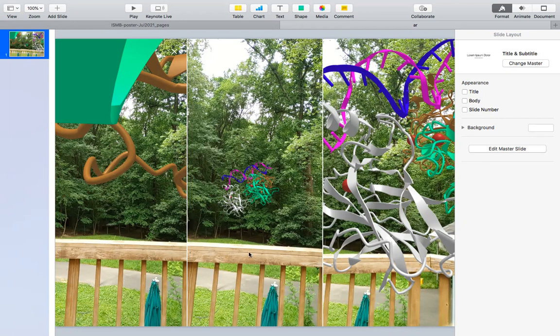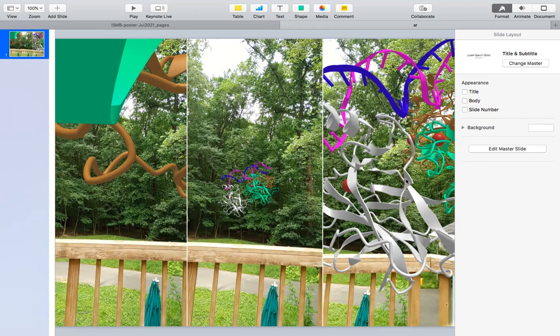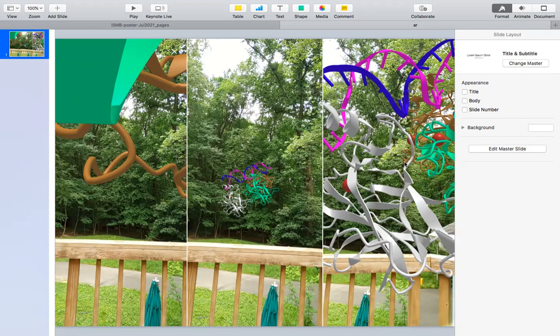You can tap once anywhere in your screen to show a minimized structure. So you tap here, you will see structure here. If you tap at the top, it will show up in the top. You can also tap twice quickly to enlarge structure a little bit. So you have three views: the original view, tap once to minimize view, tap twice to see your enlarged views.